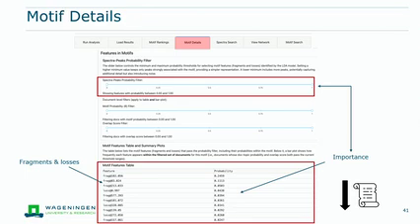If you really want to investigate what your master motif looks like, this is also all based on the old version, so if you're familiar with the old version, you should easily be able to deal with the new version. You can just filter. You can say, okay, give me only all the fragments that have a higher probability than X, 0.05. And then you can really have a look, does it make sense from my chemical knowledge or not? And there's a slider, as I just mentioned.